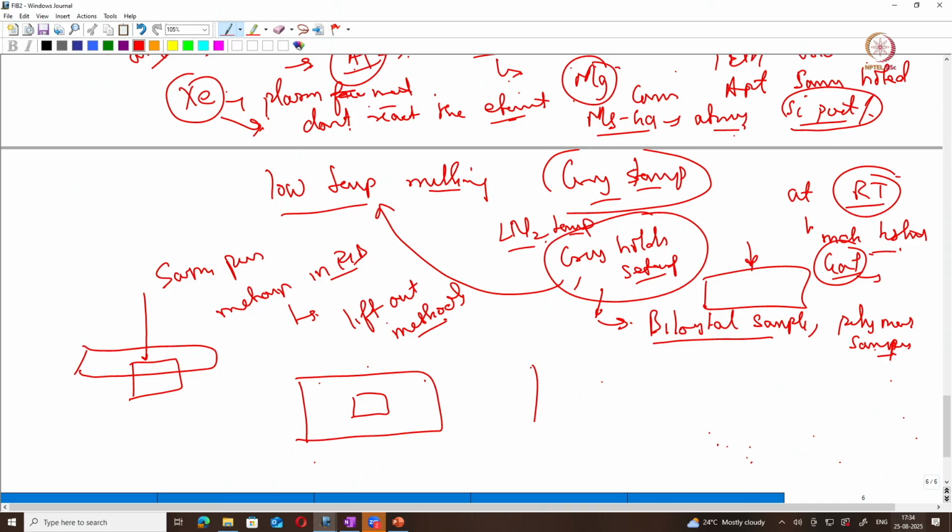If you have a sample surface, you know there is a particular boundary, but if you see the cross section, you don't know whether this boundary goes inside the sample or just comes out. So we can prepare a sample which is in plane from the sample surface, and make sure that in the needle specimen you have that particular boundary perpendicular to the tip axis, correct?